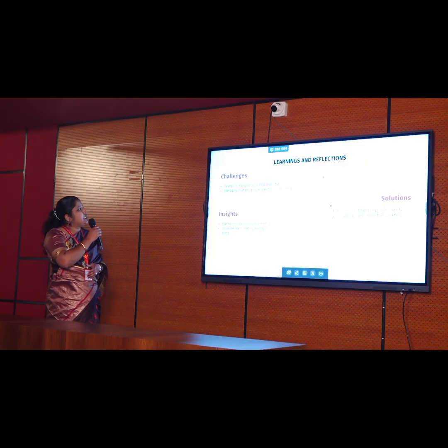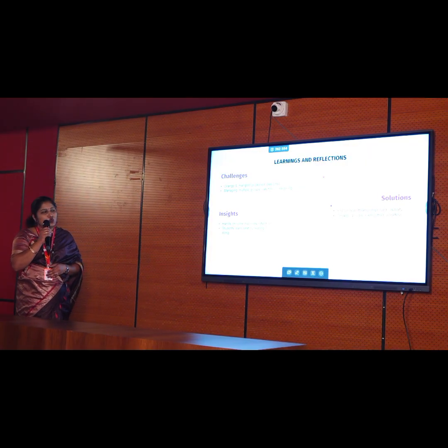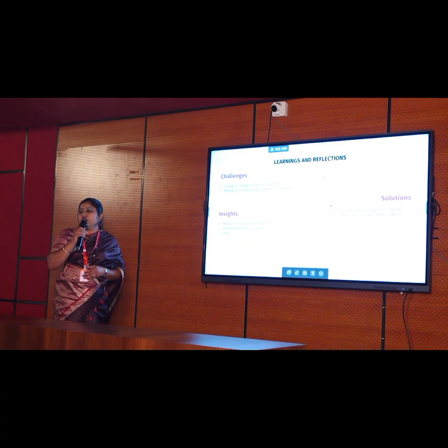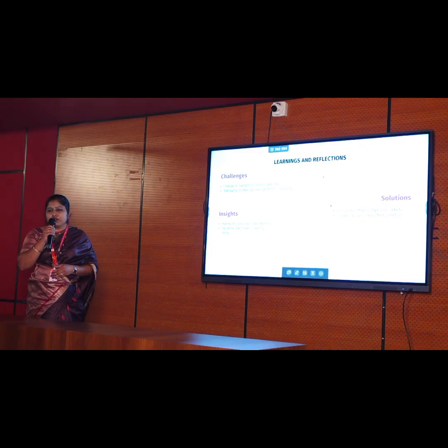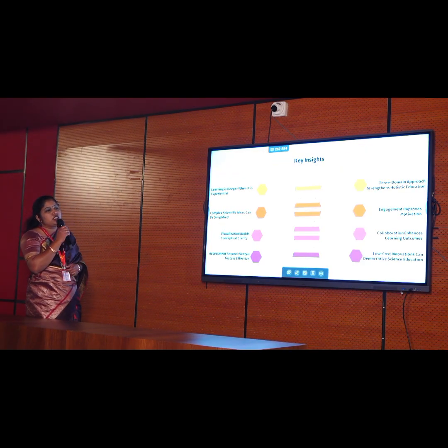Next. Learning outcomes. What we learned is that orange and marigold produce very little DNA, as I told you. We used pre-chilled ethanol. We kept the ethanol in the fridge, not at normal ethanol temperature, and then it gave us results faster. Next. These are the key insights which the students have taken.